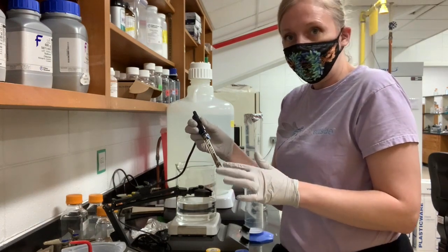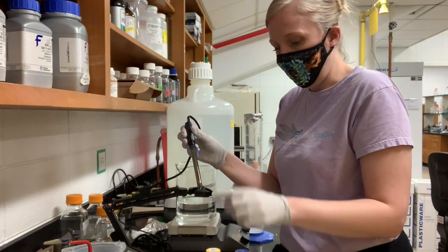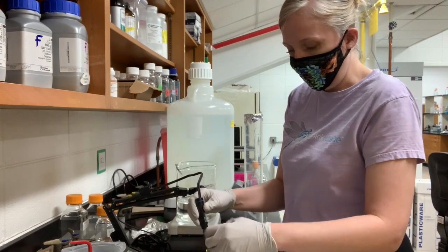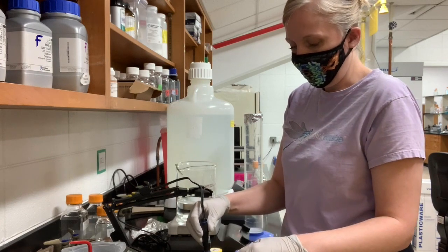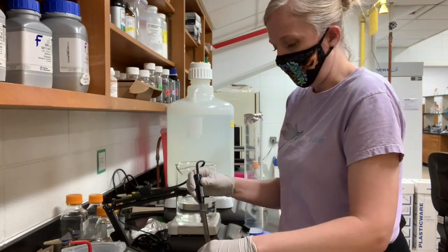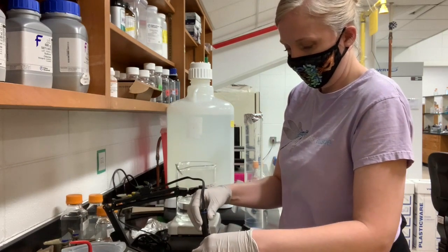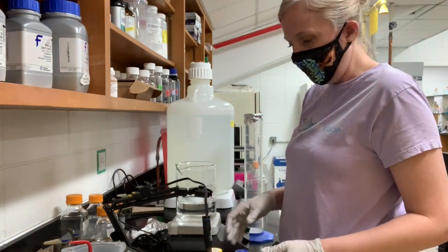You never want to let these probes stay out for very long, so what you want to do is pull this blue plug out and a little hole will open, and then you want to drop this probe into the pH 7 solution, being careful not to allow the hole to go under the surface. So I'm actually going to pour out a little bit of this because it's a little too full. Okay, so I have it sitting down in there, kind of resting against the side.